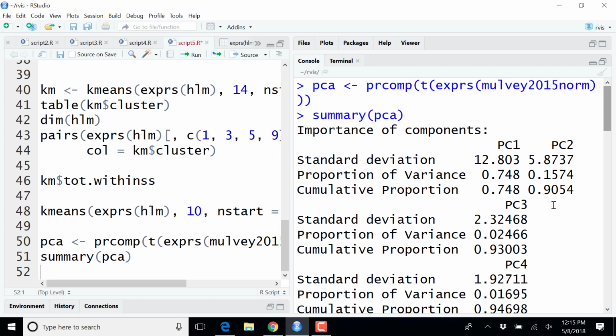And actually, if I look at the cumulative proportion, 74%, 90%. So this is an example where principal component analysis works really well, because along my first two principal components, which is what I'm going to use to visualize them, I drop information, but by just keeping the first two principal components, I still keep 90% of the overall variability that I am interested in.